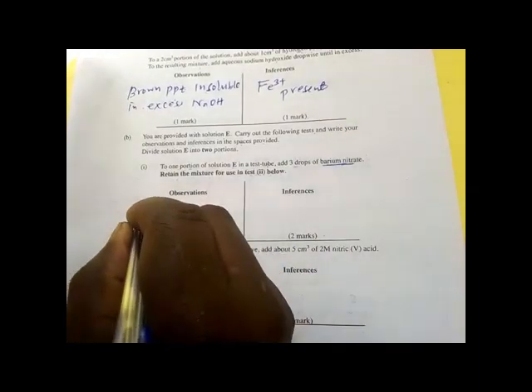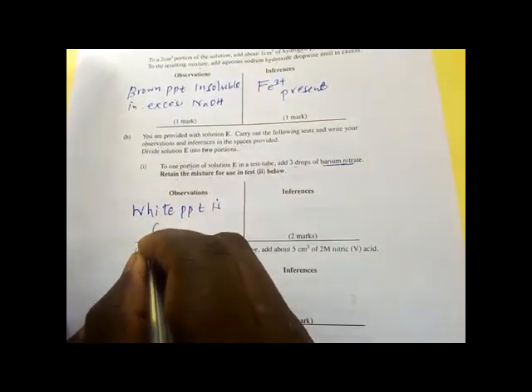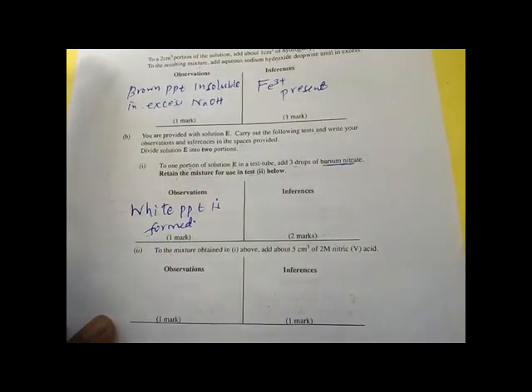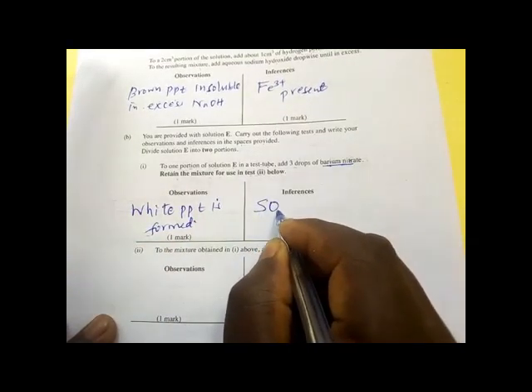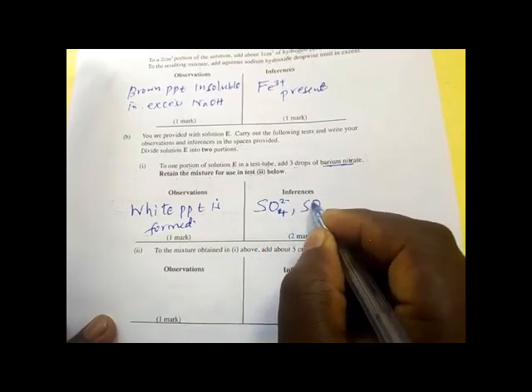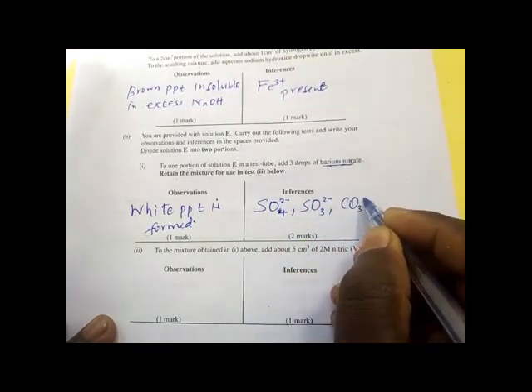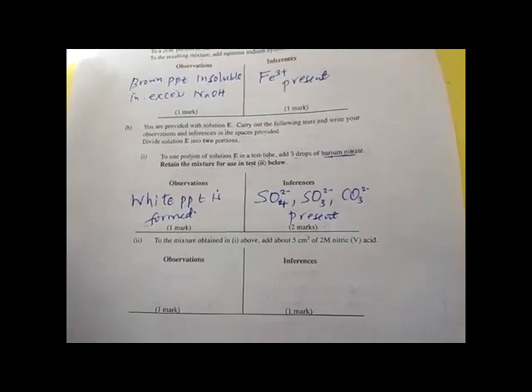A white precipitate is formed. White PPT is formed. We are adding barium nitrate, so definitely the sulfate, the sulfite, and the carbonate are present.